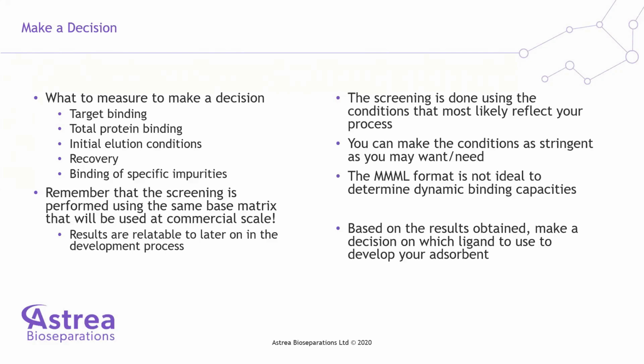So this, of course, makes it more applicable to your real life final conditions and avoids you having to change your feedstock to accommodate some limitations. As I mentioned, you can make the conditions as stringent as you may want or need. You're really looking for something that works in that plate under the conditions that you want.